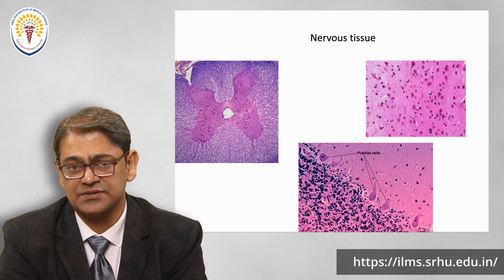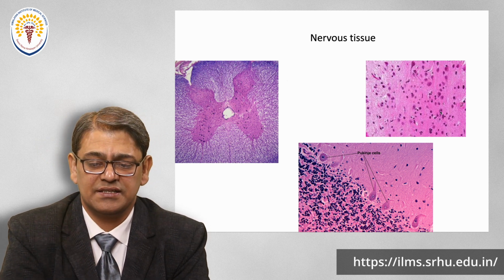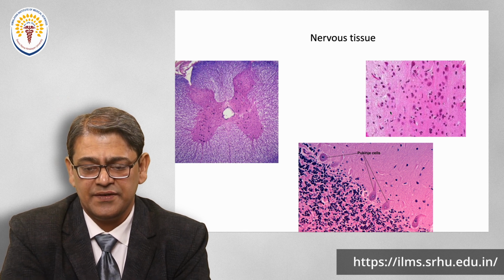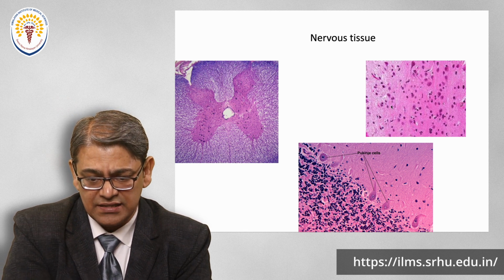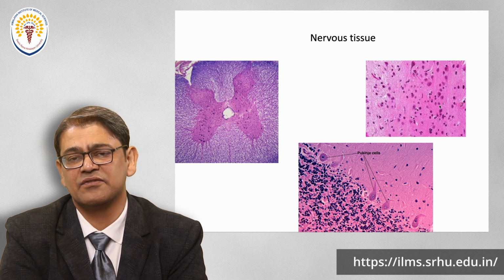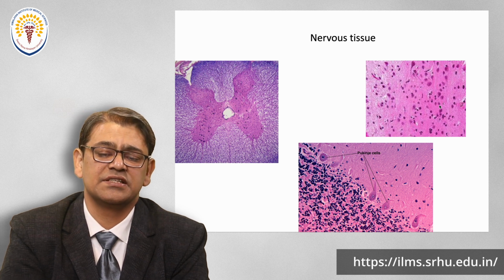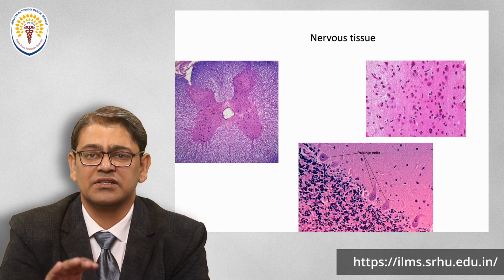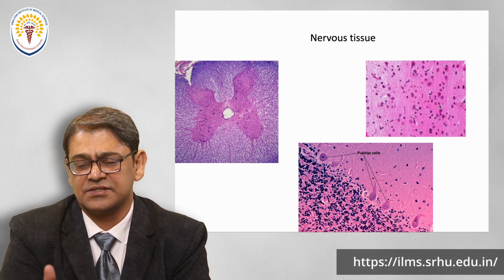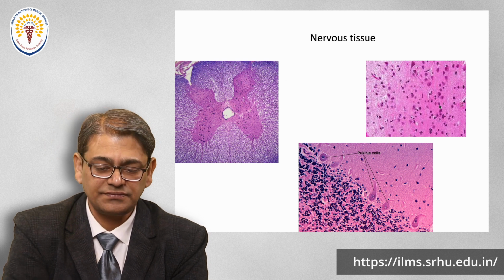In between, there are also changes. So the place where you have taken it can help you in understanding. If you observe, there is layer 1, layer 2, layer 3, layer 4. This sort of layering is visible in the cerebral cortex. But again, this is not so clear for beginners. It's a little difficult to understand the histology of the cerebral cortex, right?